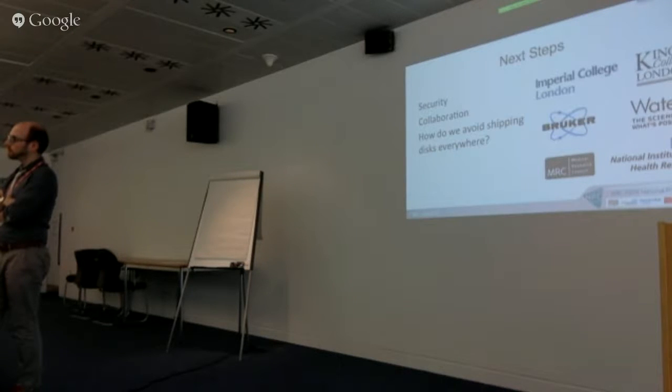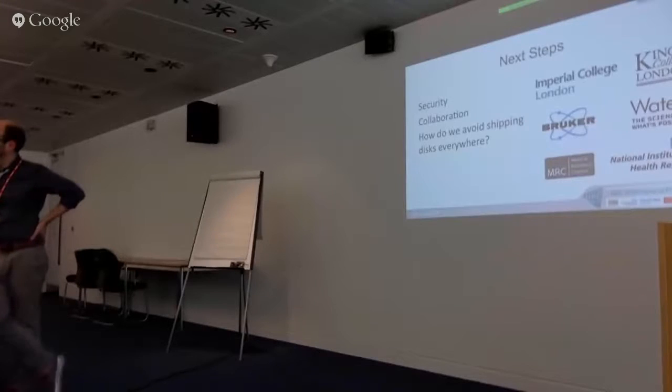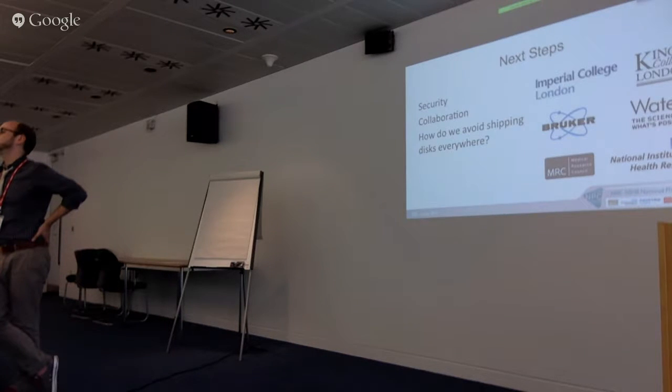One question that I immediately have, you already pointed out. I mean, obviously we can't convince funders to fund our lab projects with the numbers that you absolutely came up with. So we need to stick with the megabytes and exabytes, etc. And I actually think one of the big questions is, do we need to keep the data from the earliest time points of the acquisition, because there will be, I think it depends on the context of work.